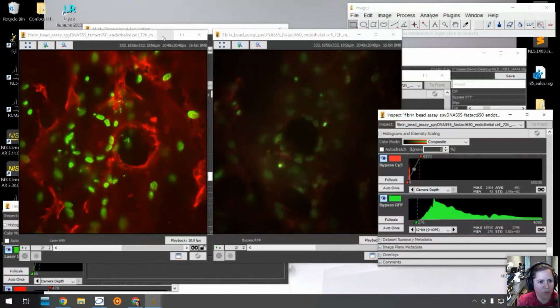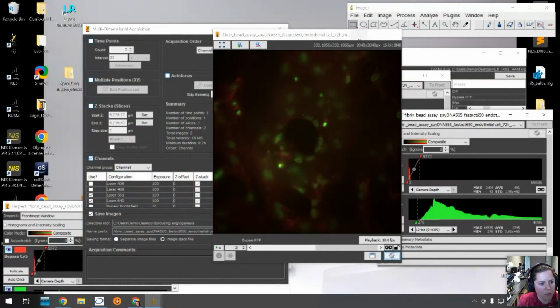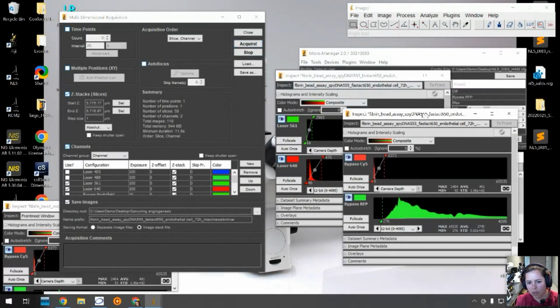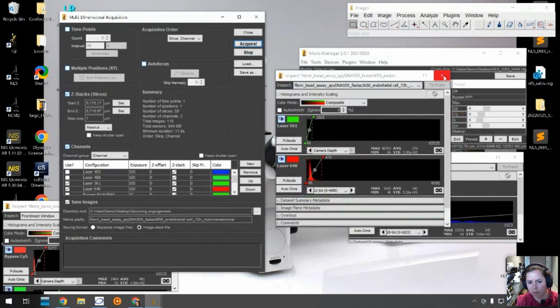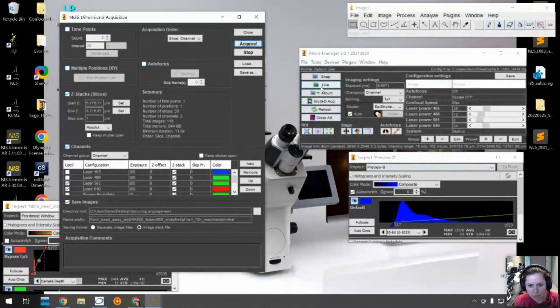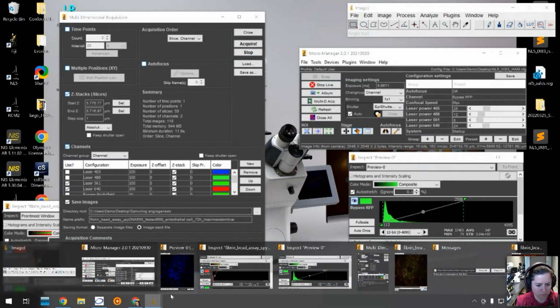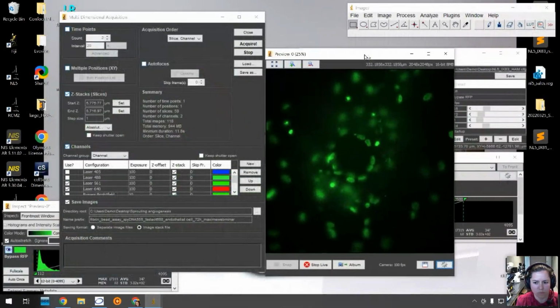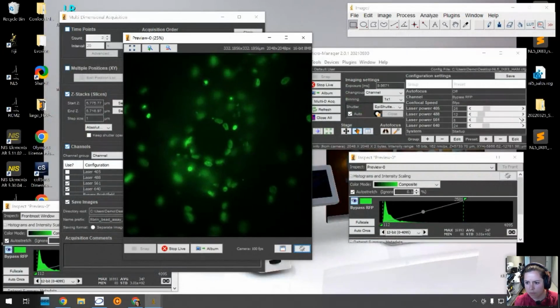Now I will show you how to do a set acquisition. I'm closing a few windows. Yeah, so we are live now.